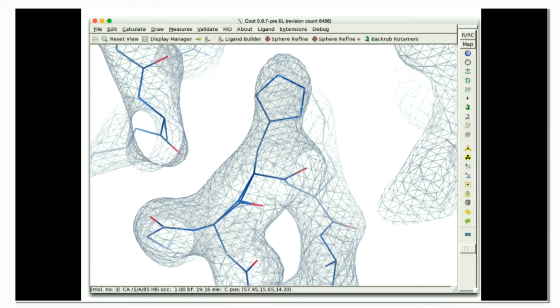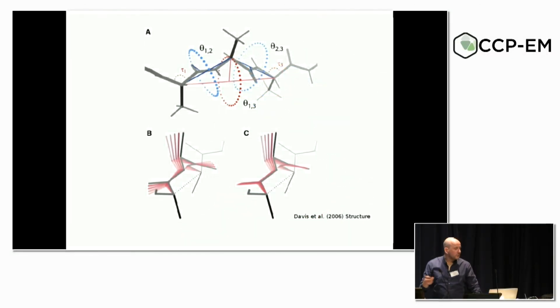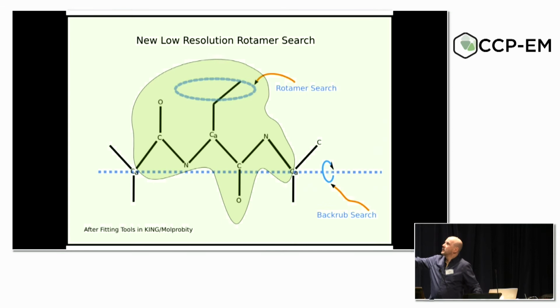We obviously don't want to do that, so we're using the formalism from the Richardsons to use the previous and next residues to construct a so-called backrub vector around which we are rotating atoms. The point being that the carbonyl oxygen and the nitrogen of the residues to which the central residue is attached are also moved as part of the optimization, which wasn't the case before.